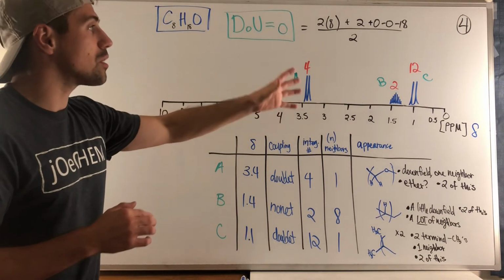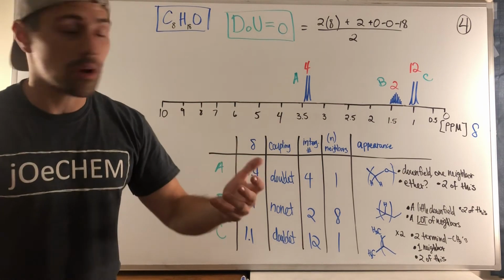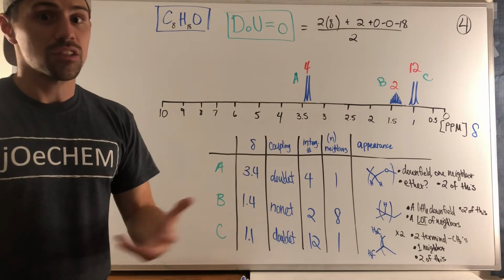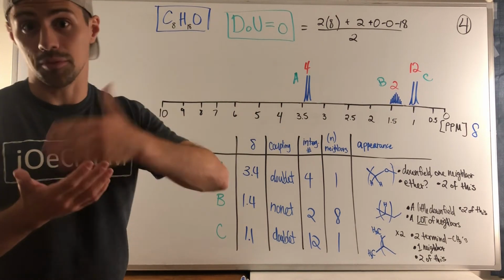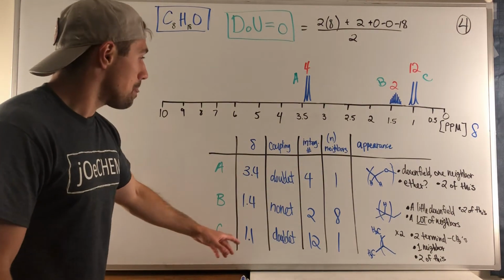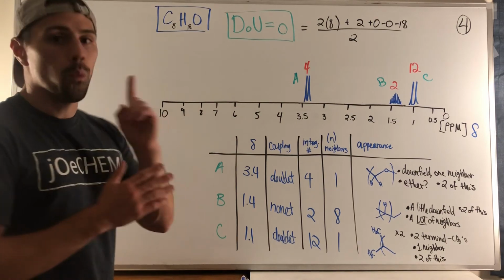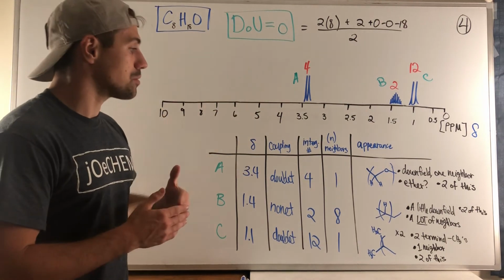Very similar to where we just have regular old CH3s and whatnot, and the integration number is divisible by 3. So you think maybe this is corresponding to some factor of terminal CH3 groups. And we only have 1 neighbor. So that got me thinking, 1 neighbor, right? And then we have so many of these CH3s.